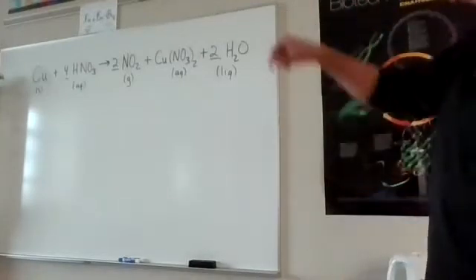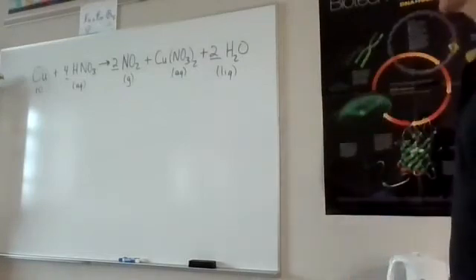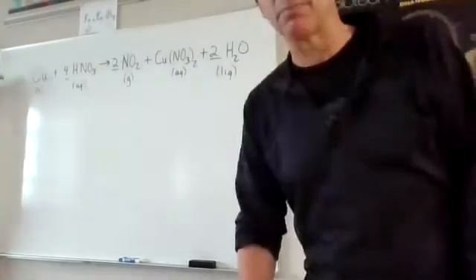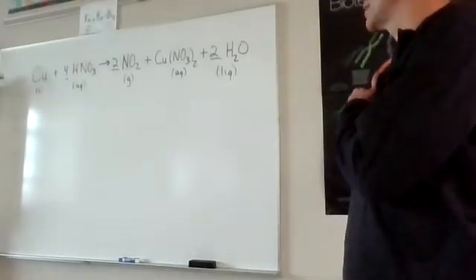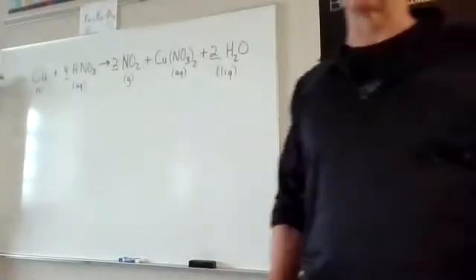Then we're getting copper(II) nitrate. No evidence of that yet, but we'll look for that coming back. And then we've got some H2O. So you have this balanced equation. It's pretty complex. There's a single displacement to some extent, but then there's a breakdown of a gas, a decomposition. So we have a few things going on right here.